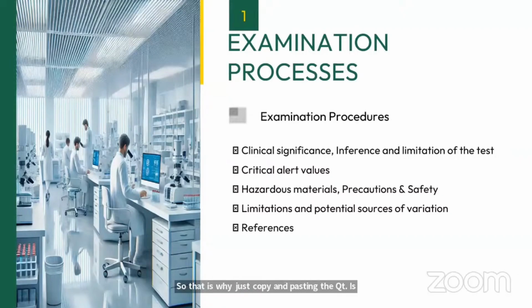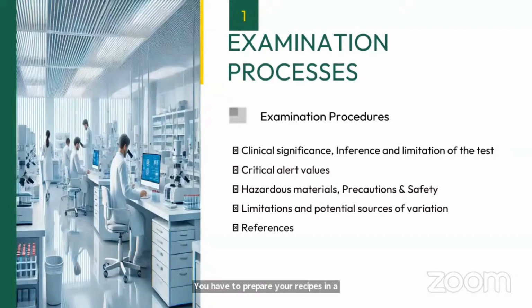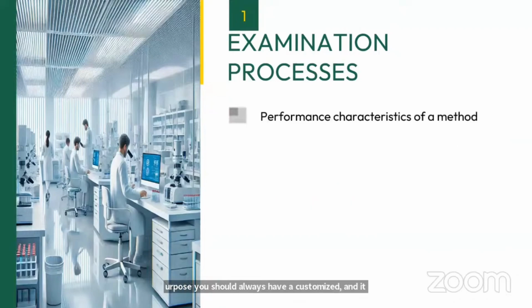You have to prepare your SOPs in very simple language. You should know what is the relevant part for your technical staff, what is not relevant for them, what areas they should emphasize. For that purpose, you should always have a customized standard operating procedure, and it should not be a copy paste of your kit insert.